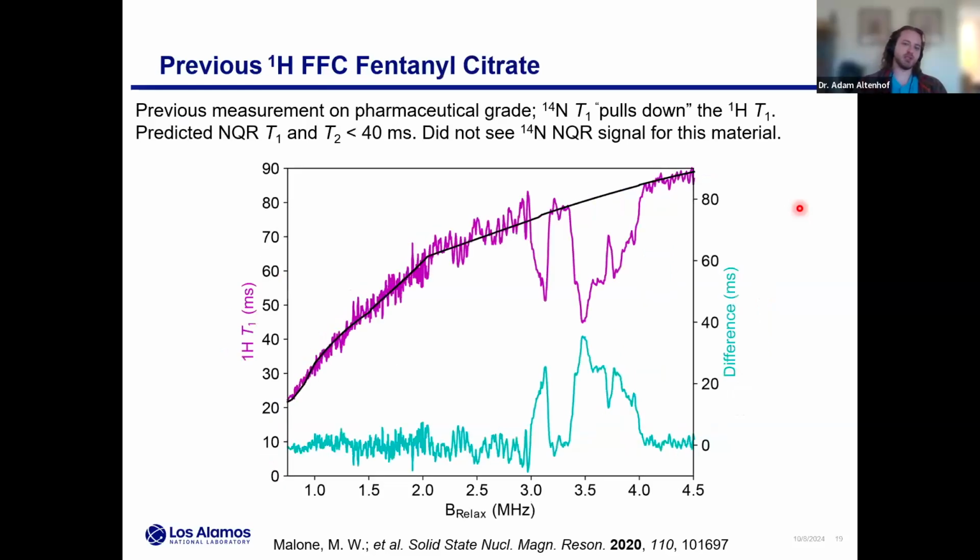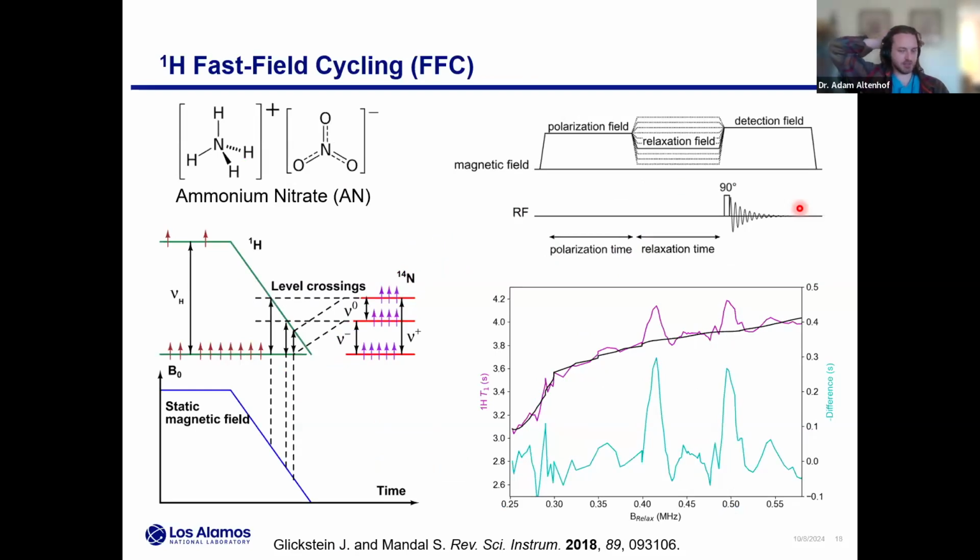Yeah, the dips are most often coming from just the fact that the NQR T1 is less than that of the proton. When it's increasing, that simply means the NQR T1 is in fact longer than the proton T1, which is the case in ammonium nitrate. The proton T1 at these frequencies compared to that of the NQR: if it is longer, it will be an augmentation rather than a dip, but the same mechanism.